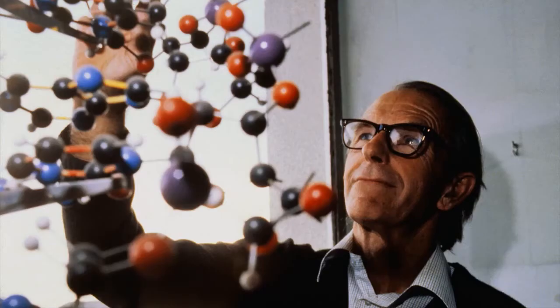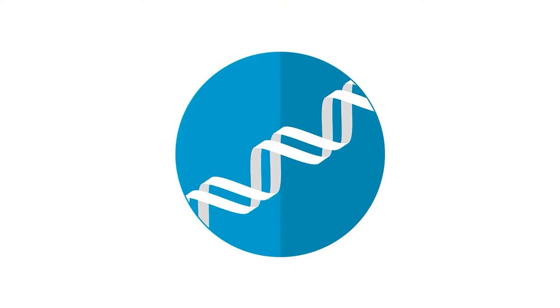The first DNA sequencing method, and the most used up to this day, was developed in the 70s by the biochemist Frederick Sanger and his collaborators. It is known as the Sanger sequencing method. Let's recall some basic principles of DNA.